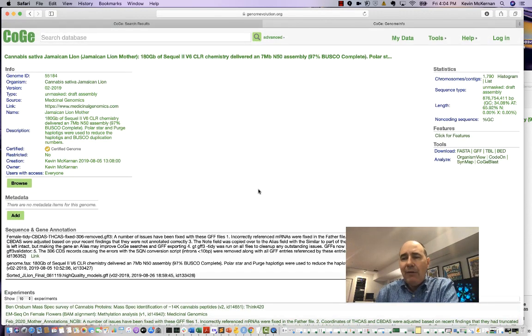If you want to download this genome, there's a download button. There is a GFF download in here as well. We have had some people report that downloading GFF from CoGe changes the format a little bit, so just be aware of that. And there are 2 different ways to download it. There's this tab and one other tab: when you click on the actual experiment itself, I think when you download that, you get the exact file we put in there. If you download off of this, there might be some modifications that CoGe added. So 2 different ways to download those, just be aware of it.